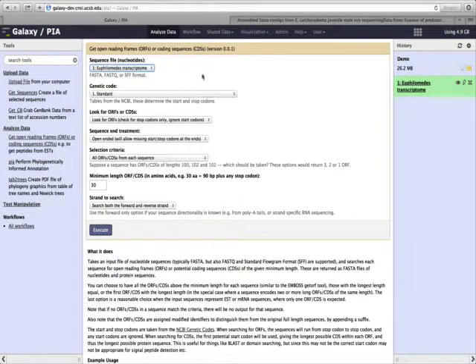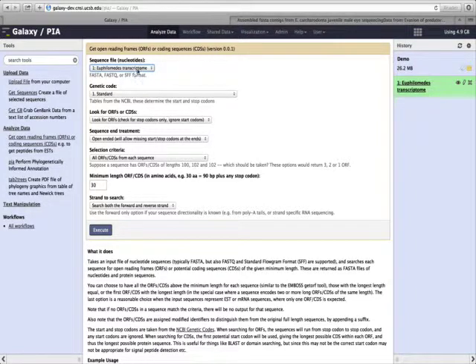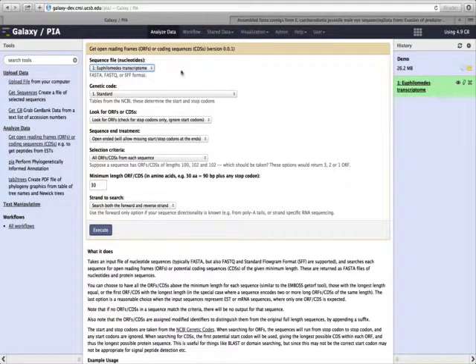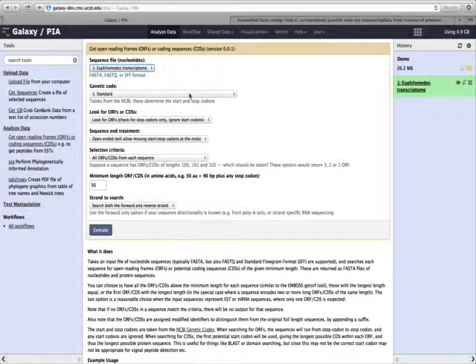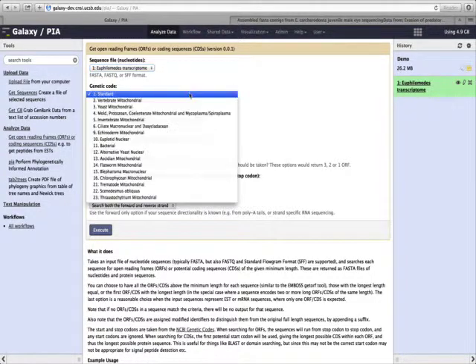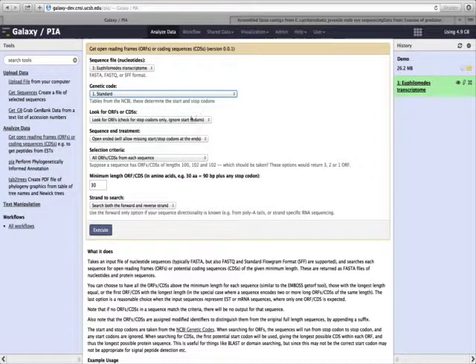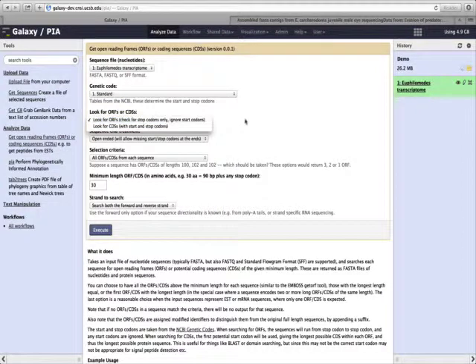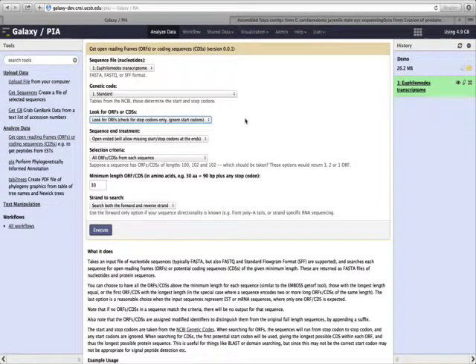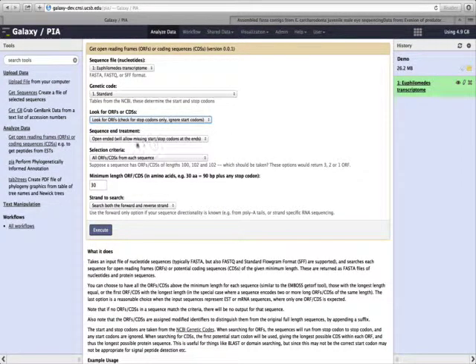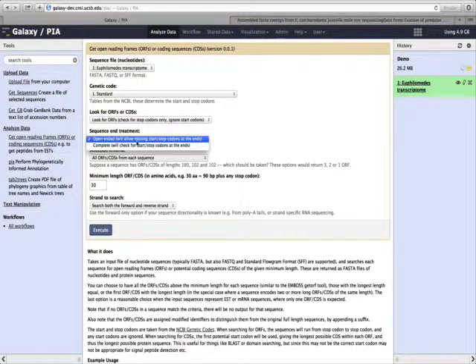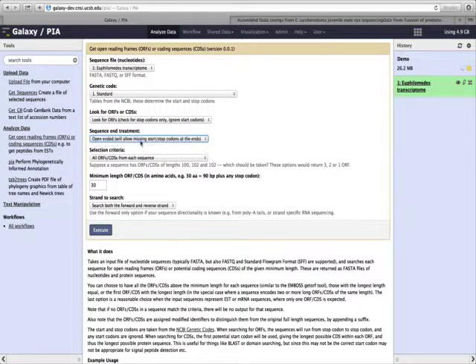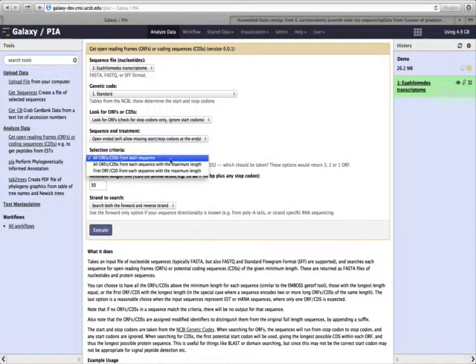The first thing we need to choose is our dataset, and I want to translate this Euphilomedes transcriptome. Next, we choose the genetic code, which will be standard. We can choose some different options. Here I will only check for stop codons and ignore start codons. This will be open-ended, and it doesn't require start and stop codons.